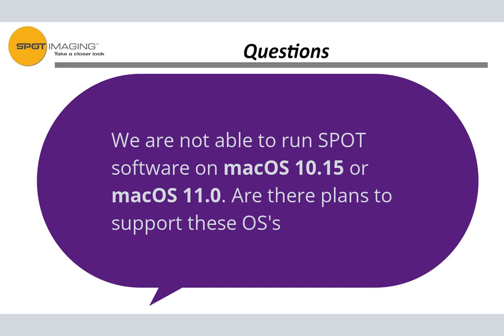The workaround that we have right now, that allows you to support the Spot cameras on the newer operating systems, is that if you get Parallels, which is a program that runs a parallel version of the Windows operating system, Windows 10, on your Mac computer, then we can install the Spot software on that and run it there.